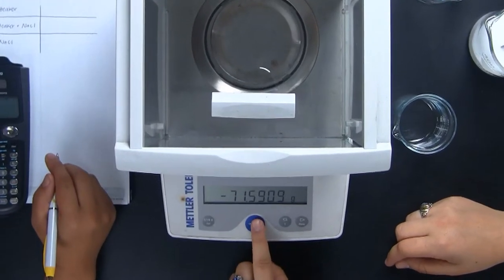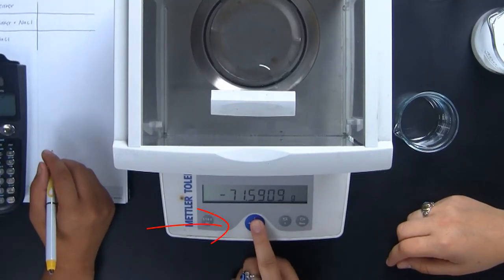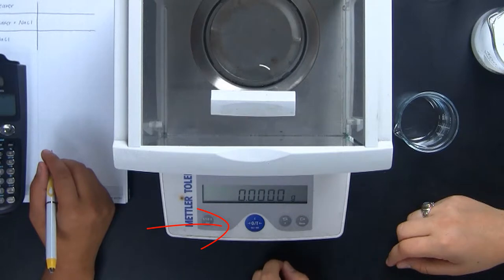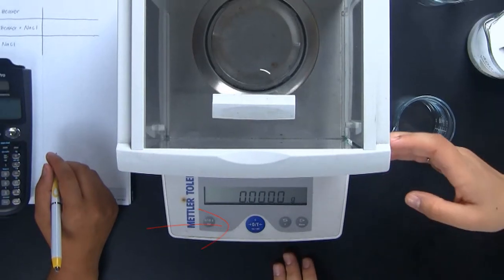Before we start, Ileana is going to zero the balance. Remember, we never put any reagents directly onto the balance pan.